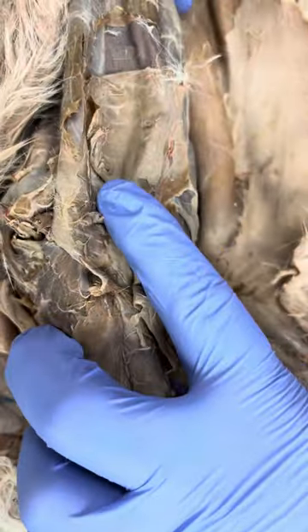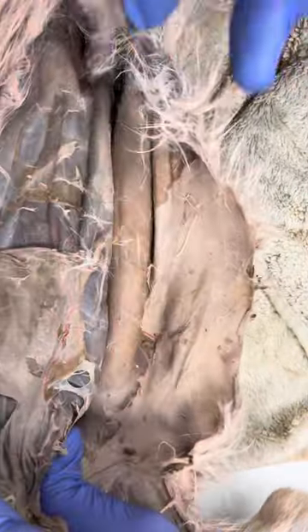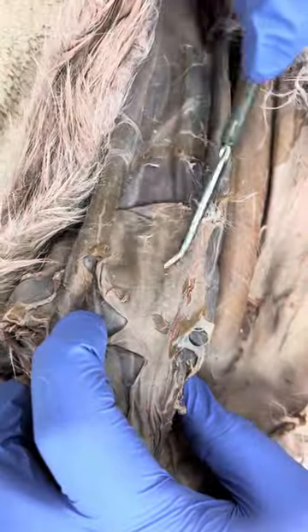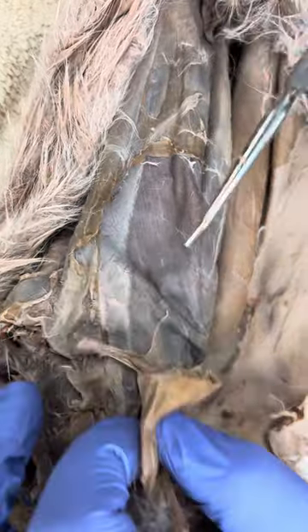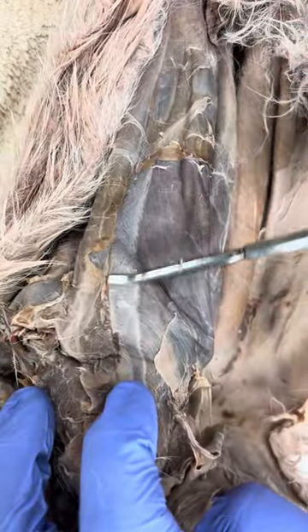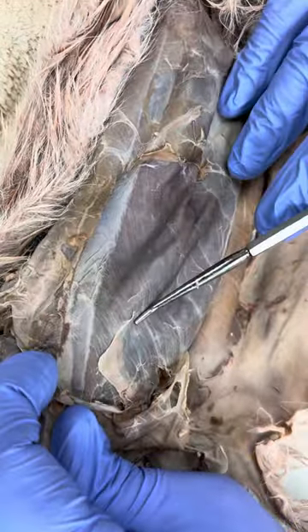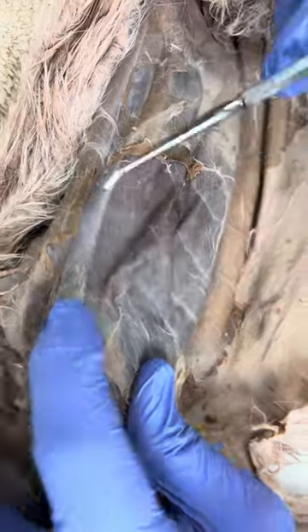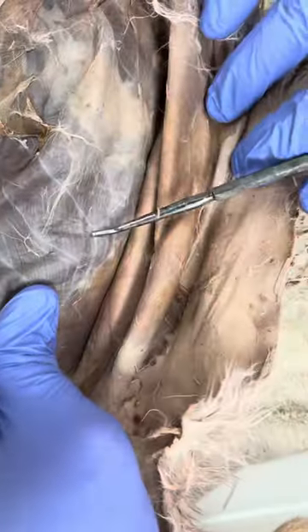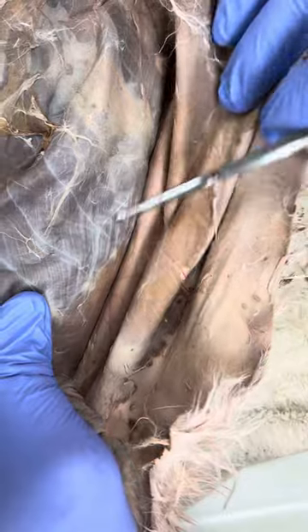If we go to the abdominal muscles, this is going to be my external oblique that's right here. And then if I take the external oblique off, this is my rectus abdominis that you see going this way. This is my transverse abdominis that you see going this way. And then if I go over to the side, this is going to be my internal oblique muscle right here.